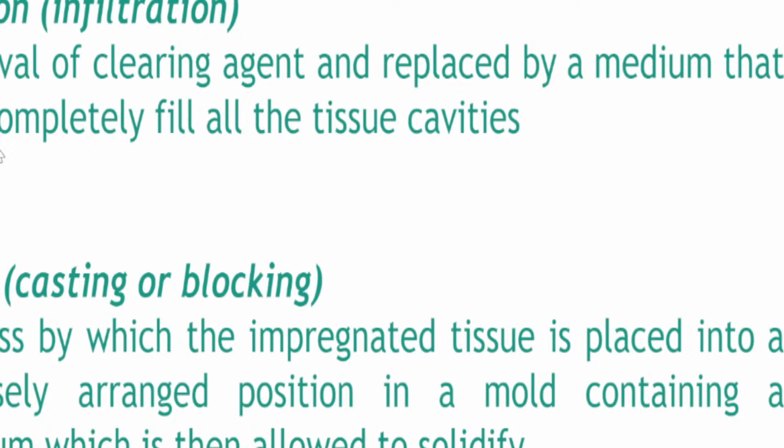When you embed, you place it in your tissue block, in your holders. That's the only difference, but both have a purpose, class. Embedding is called embedding because it's to precisely align the tissue in the position that the pathologist placed it in.